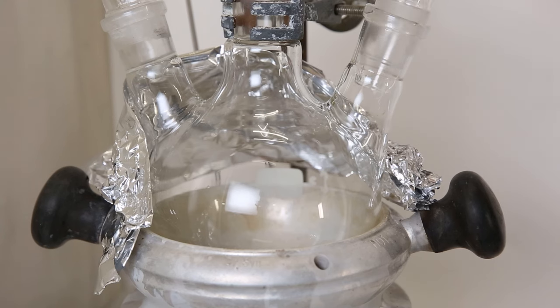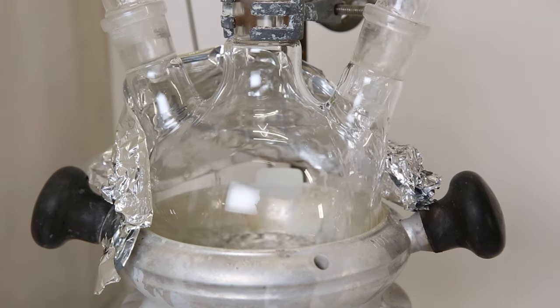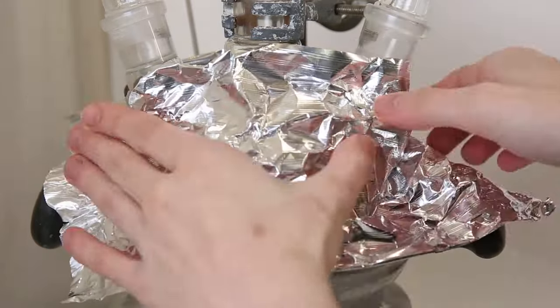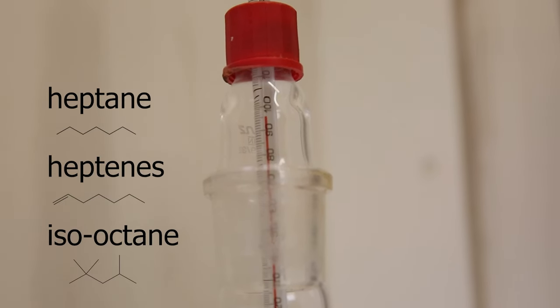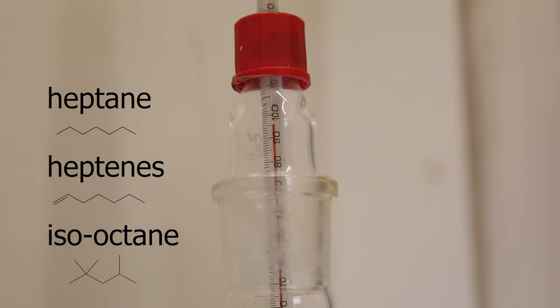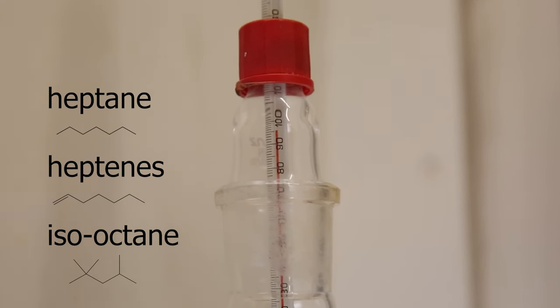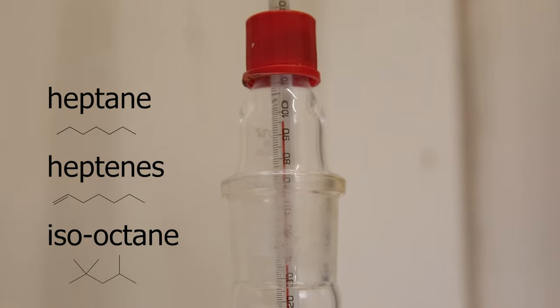Then, I put all the contents of this bottle into the flask for redistillation. I heat it up quickly, and distilled over everything up until 96°C. After a while, it stopped coming over, so the iso-octane and heptane is now in this fraction.